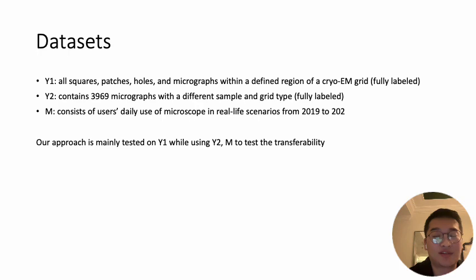So this results in a fully labeled dataset. And the Y2 dataset is similar to the Y1 dataset. We have 3,969 micrographs with different sample and grid types. This is also a fully labeled dataset. In summary, we train our model on the Y1 dataset and evaluate it on the Y2 dataset.